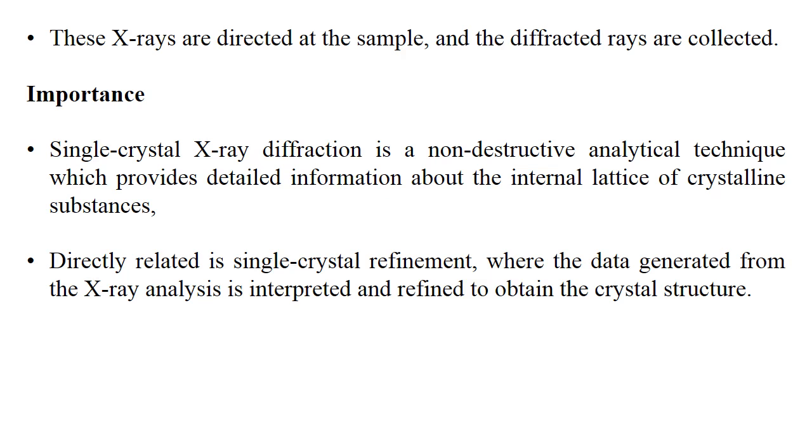Directly related is single crystal refinement, where the data generated from the X-ray analysis is interpreted and refined to obtain the crystal structure.